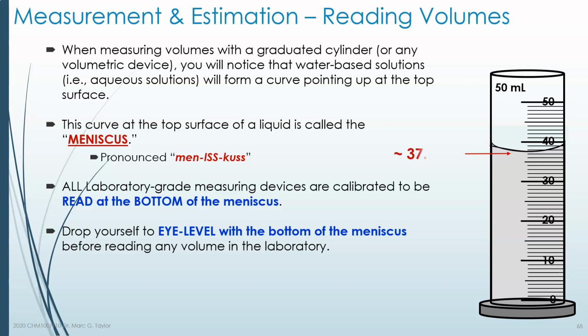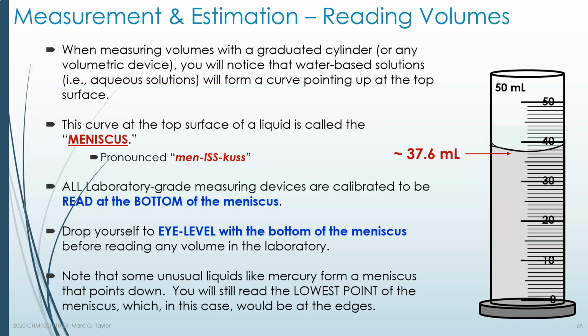the meniscus. So in this case, I'm estimating that this volume is between 37 and 38 milliliters, and a little bit closer to 38, so I'm saying 37.6 milliliters.